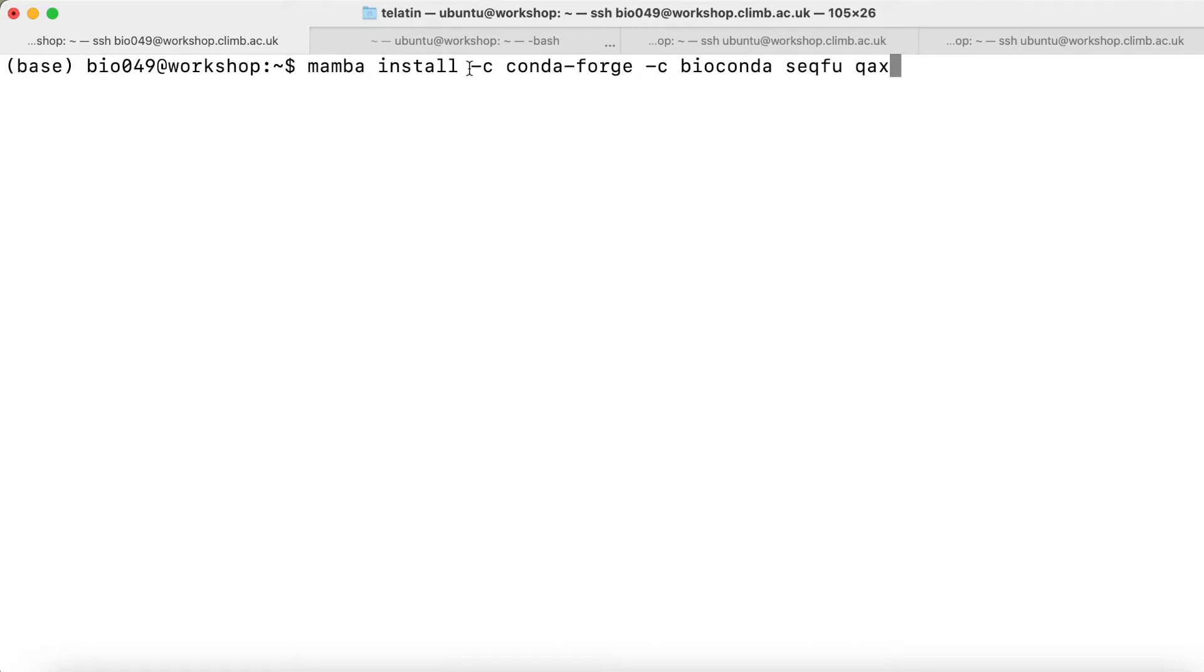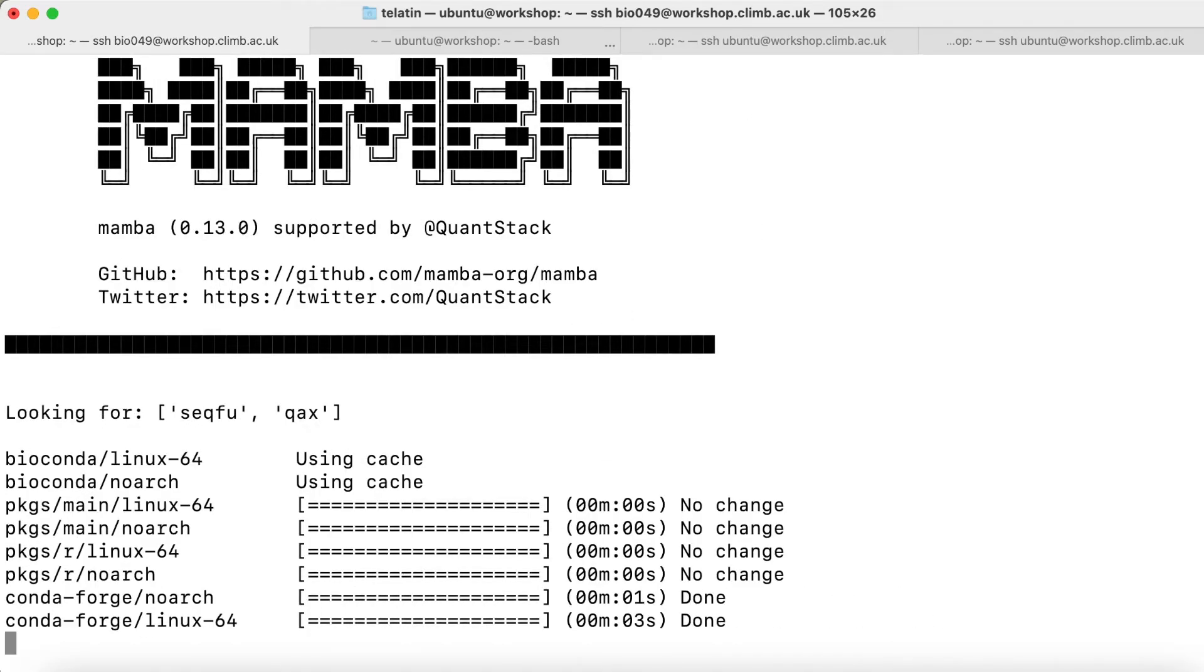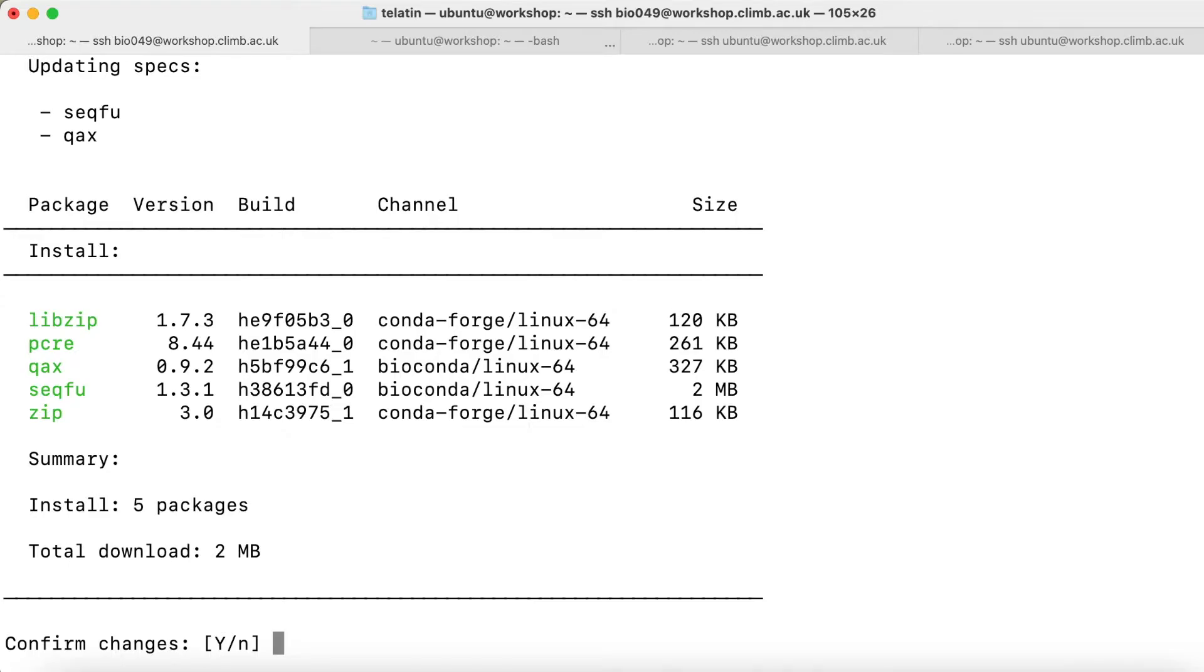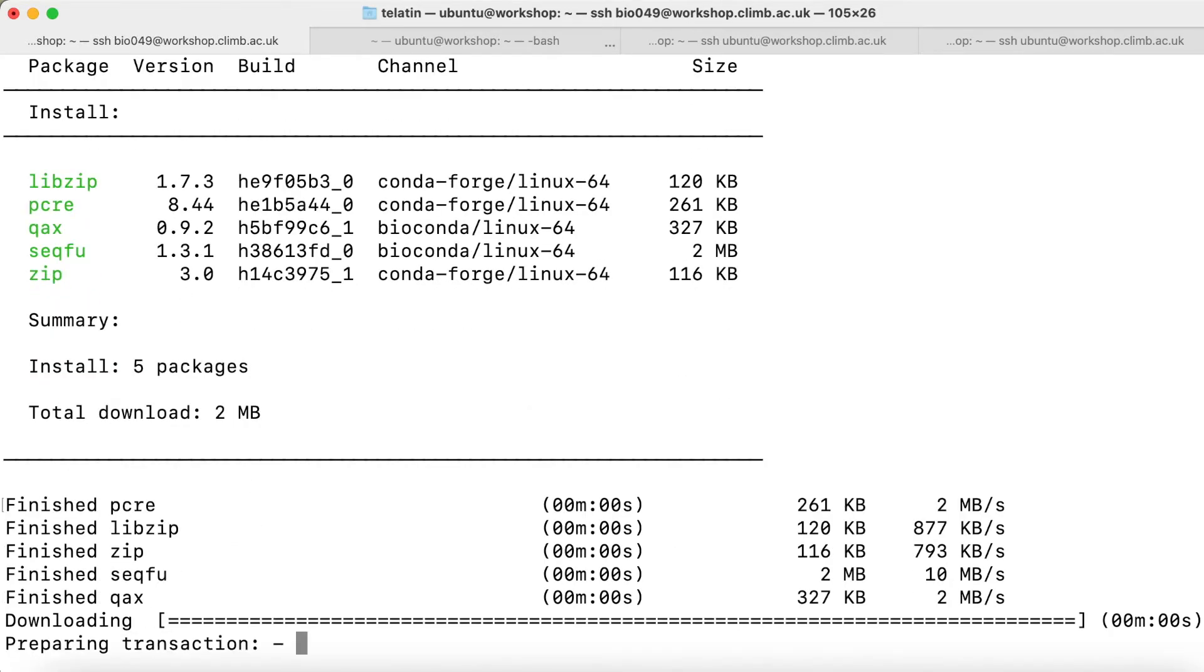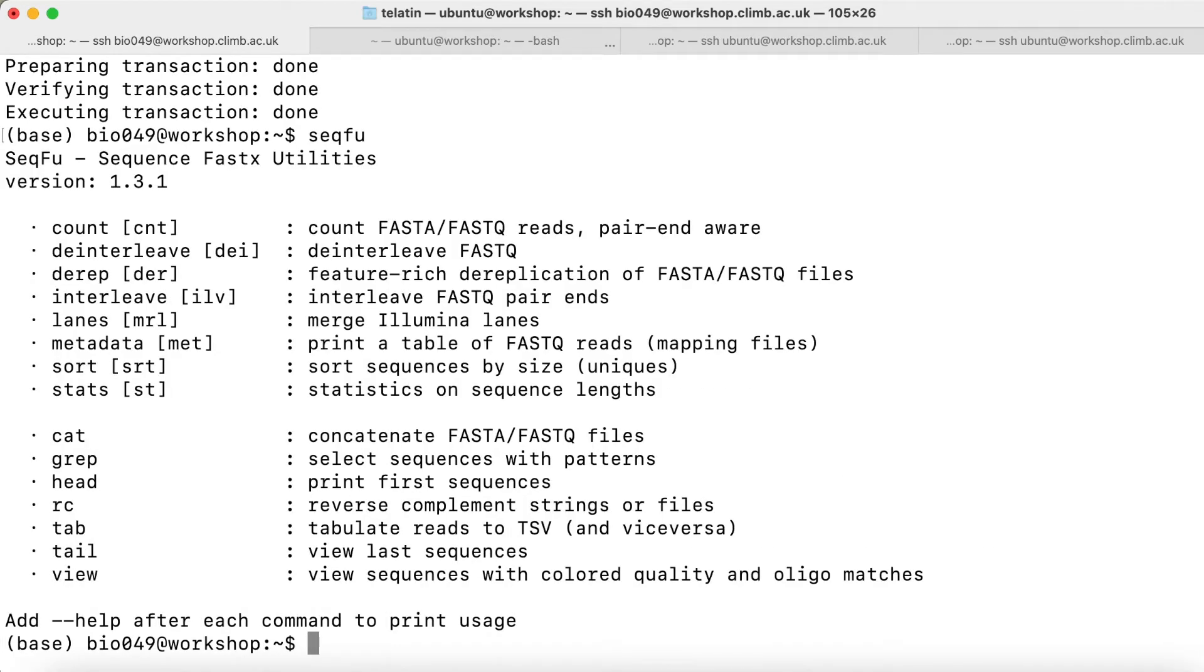We need to use multiple channels, minus C the first channel, and then minus C again the second channel. Again we are asked to confirm, and this time we installed two packages with Mamba. If we type seqfu, we should have the first splash screen working.